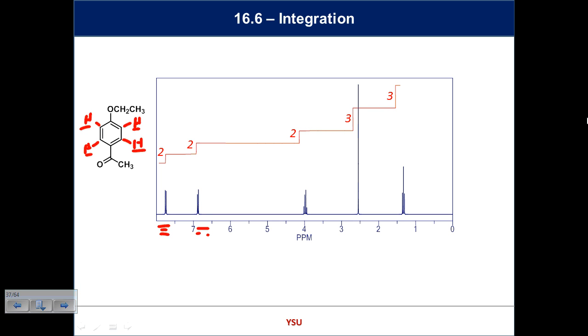But that clean benzene ring region tells you a lot about symmetry. It tells you what type of pattern you have on the benzene system. But again, without overdoing this, 2 hydrogens for those 2 sets, 2 hydrogens for the CH2 group, 3 hydrogens for the methyl group, which one is probably alpha to the carbonyl, and then this signal here, 1.3-ish, for the methyl group up there.